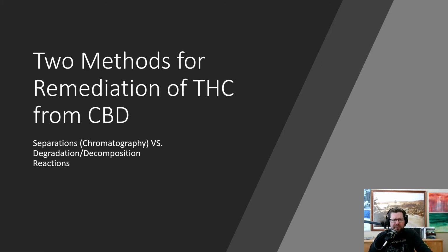Hey, today we're going to be talking a little bit about remediation for THC from CBD. There's a lot of different ideas about how to do it, and we're going to be comparing and contrasting separations versus degradation or decomposition reactions for the remediation of THC.